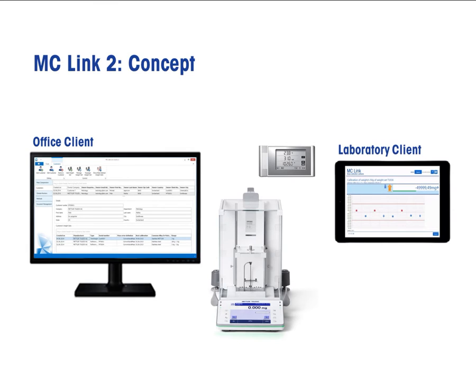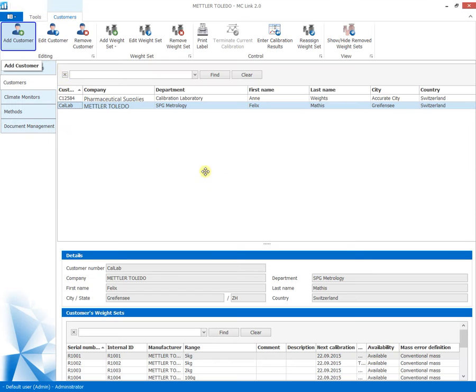With the laboratory client on a tablet, the process is visually controlled in real time, and statistical evaluation of the calibration process is displayed instantly. Mass calibration becomes reliable and efficient at the same time.